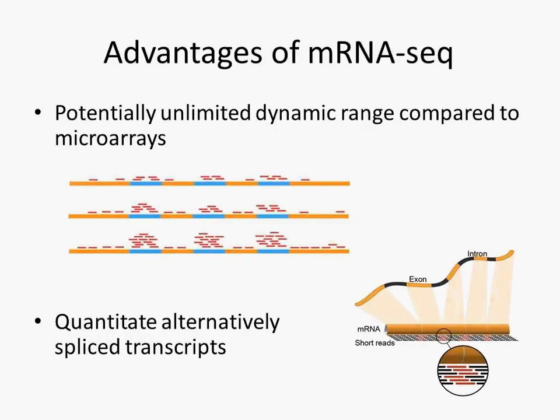The advantages of mRNA-seq, the major ones, there are two of them. The first is the potentially unlimited dynamic range compared to microarrays. Consider a gene that has a very low expression level: it's very difficult to distinguish reads that align to that gene's exons from the background.